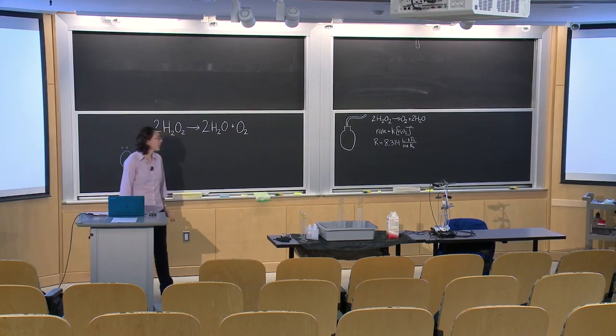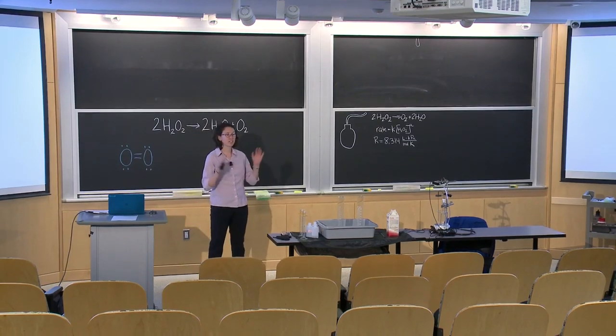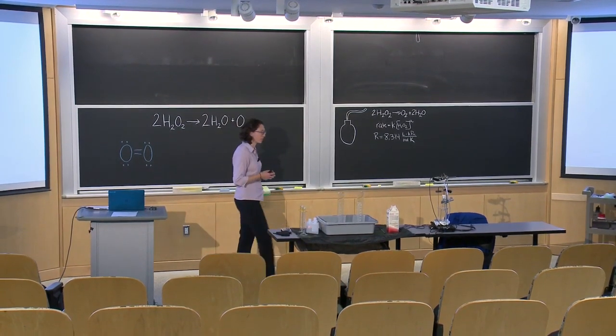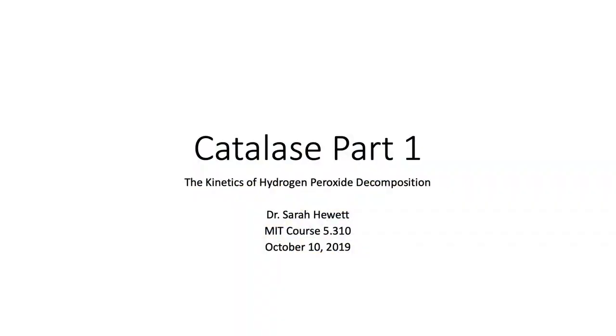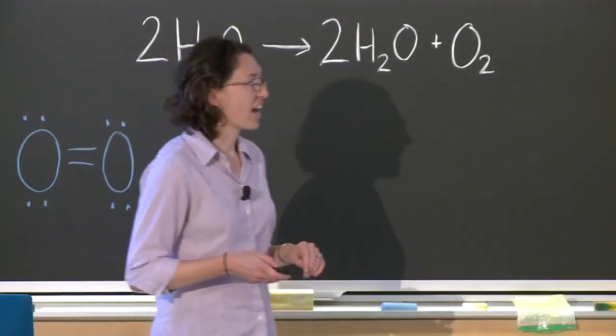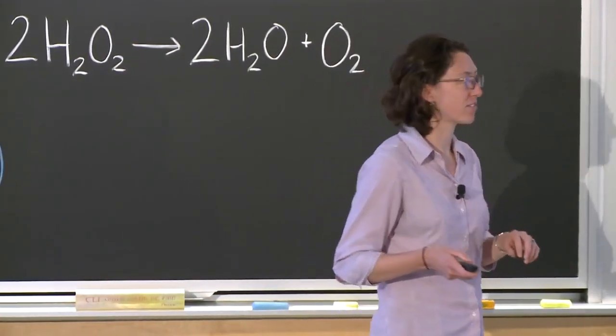So good afternoon. And today we are going to start talking about the final lab that we are going to talk about in the lecture, and the final lab that you haven't heard about yet for the course, which is the Catalase lab. Some of you started that yesterday, and some of you will start it today. And then the rest of you will have to wait a little bit. But the Catalase lab is our biochemistry type lab that we're doing in 5310.